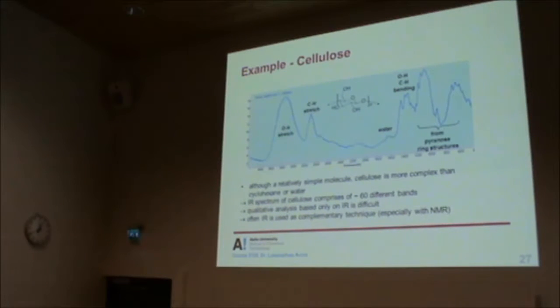Now, from there we'll go to some molecule that has a lot of relevance to all of us, which is cellulose. Now, as soon as you see this structure, you should be able to guess what kind of stretches, what kind of bending, rocking you expect from the spectrum.